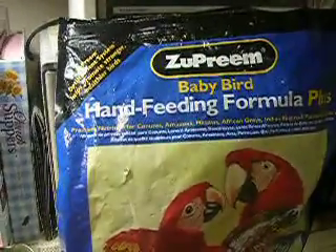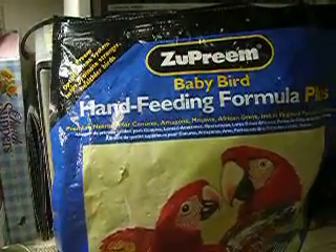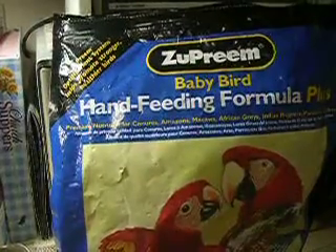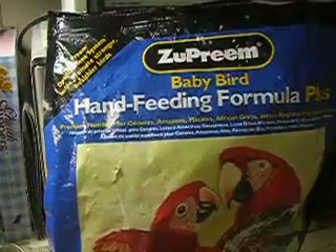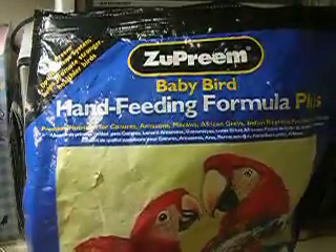I'm only doing this for the purpose of preventing other linnys from dying. This is a kind of autopsy to show why birds get aspirated, how it happened, and how to avoid it.